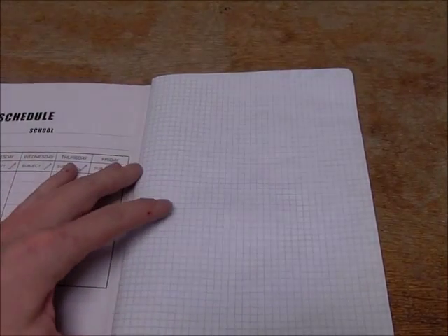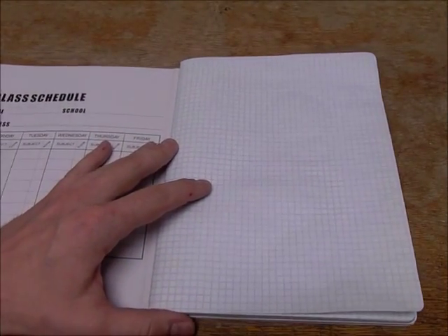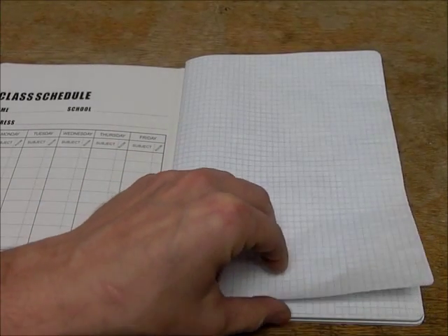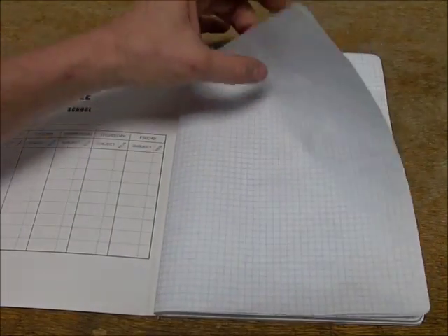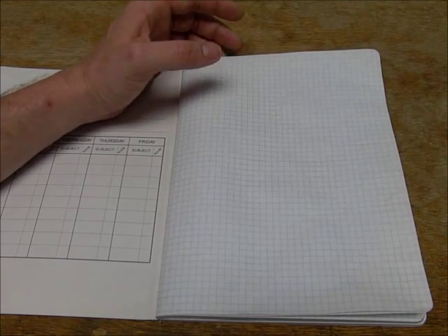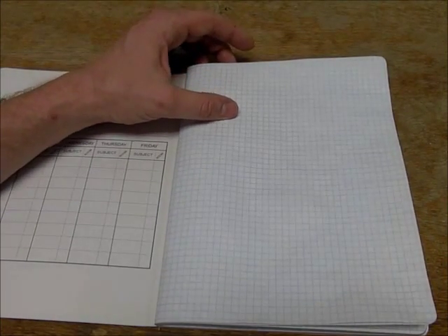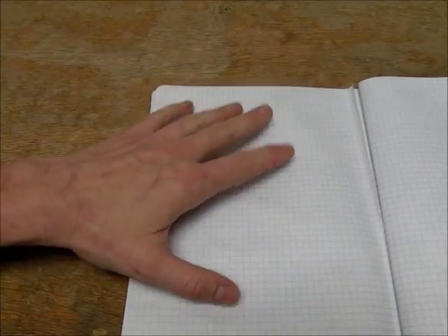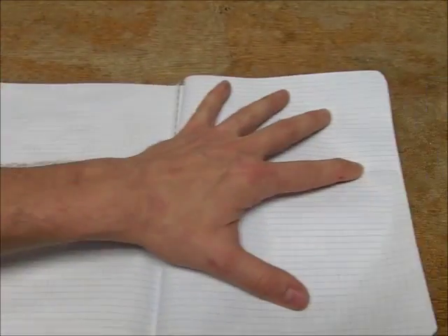Now we're going to set up the lab notebook itself, so it has all the proper components before we even start doing an experiment. In this lab notebook, if you wanted to go ahead and choose to write on the right-hand side or the left-hand side of the page, it doesn't matter. But you only get to write on one side of the piece of paper. If you write on both sides, the ink is going to bleed through and make it impossible to read anything on either side. So for this entire year, you get to pick one side of the sheet to write on only. If you're left-handed, you can start on the left-hand side. If you're right-handed, it'll probably make a whole lot more sense to start on that page instead.